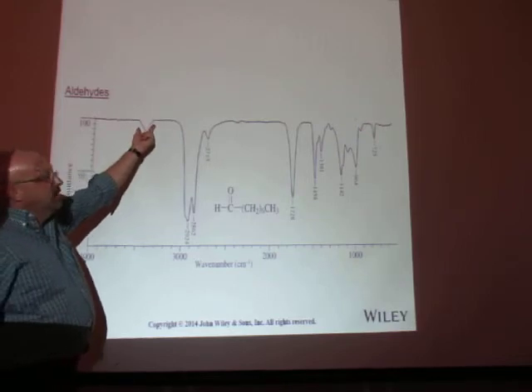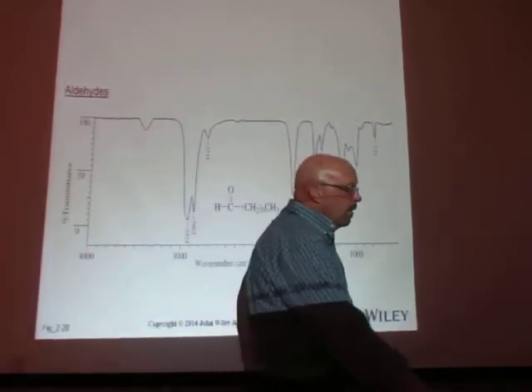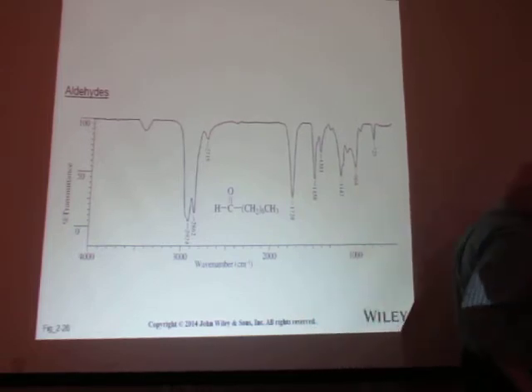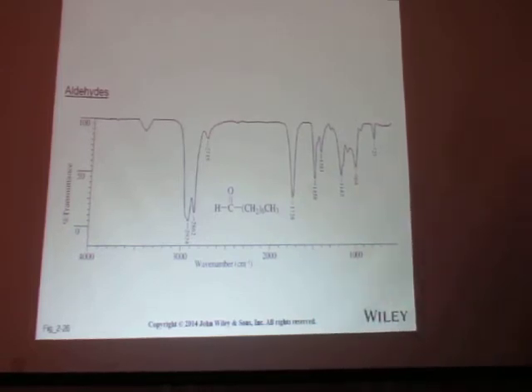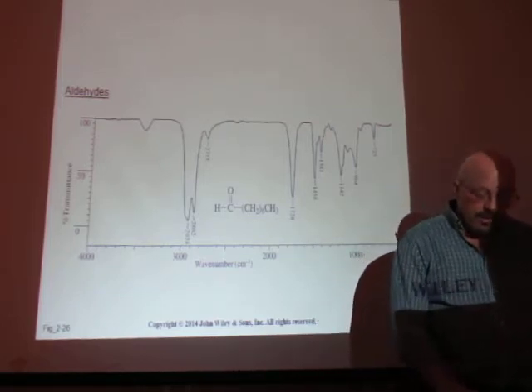This one also has a little bit of OH in there. So that could be water, or it could be a little alcohol that's in there. Some little impurity that's in there. So when we start taking IR spectra of your products in the lab, I will be able to see impurity peaks. You got peaks to identify your product, but then you also have impurity peaks as well. So I will be grading you on that. Okay, so that's an aldehyde. Questions on aldehydes?